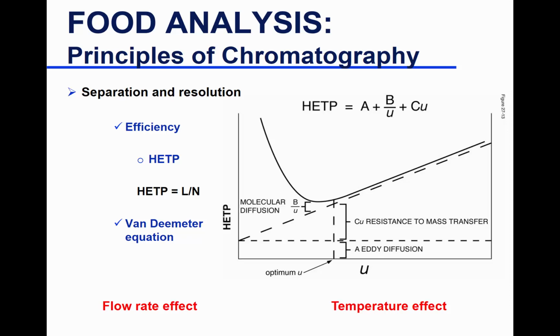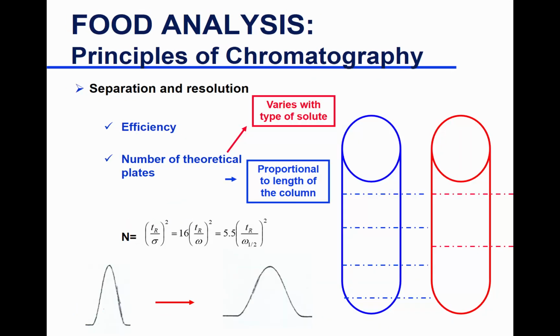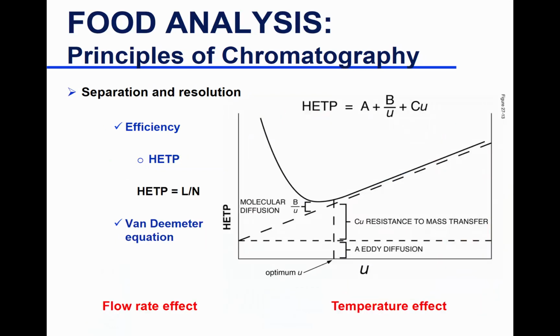For the quiz, do we need to memorize each one of these equations? You need to know the height equivalent of a theoretical plate, but no, you don't need to memorize this. You just have to understand that it has a relationship between retention time and the width of the peak. I'll talk about it more on Monday because Gary's going to talk about GC this Friday.